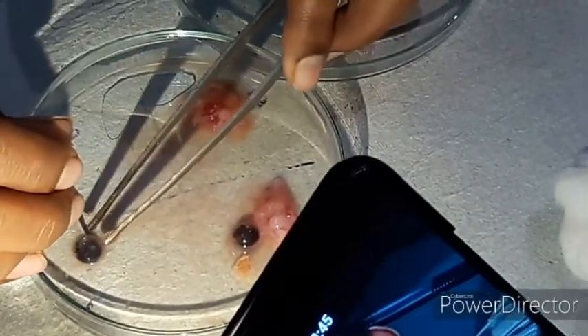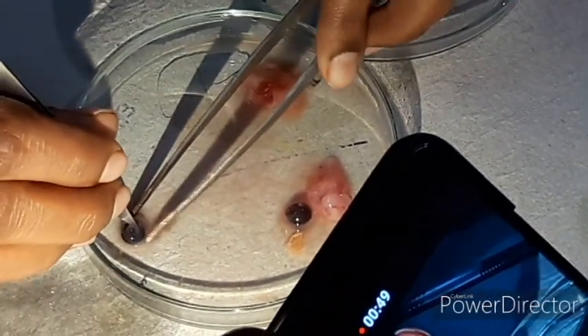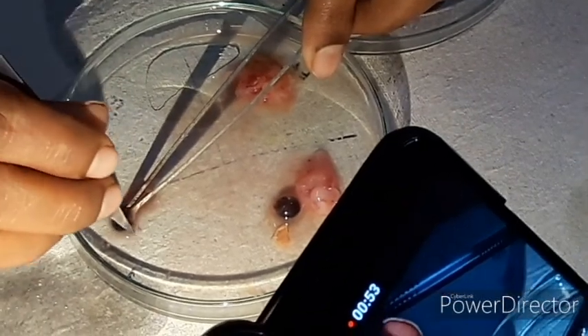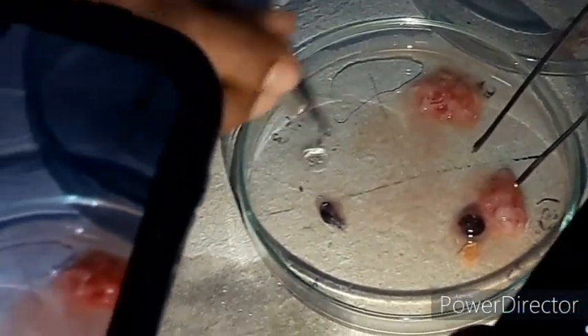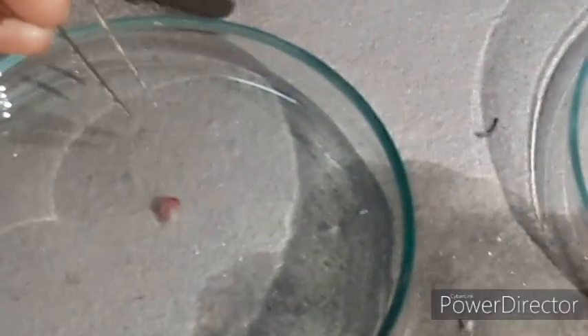The eye is separated and held whole with the help of a forcep. The pigmented retina is removed to release the lens and vitreous humor of the eye. The lens is also separated. In this way, we can separate and properly remove each component.